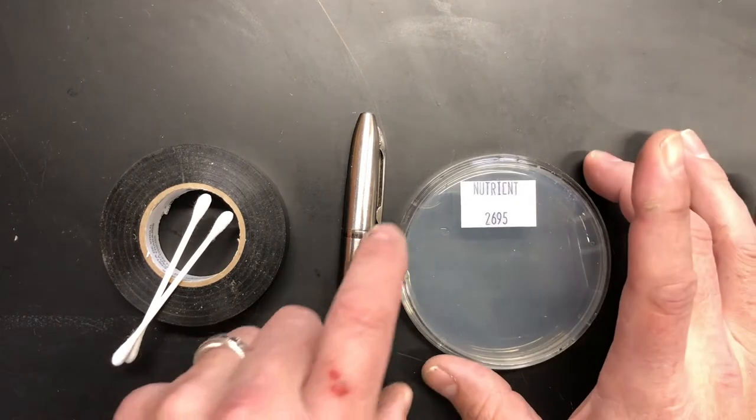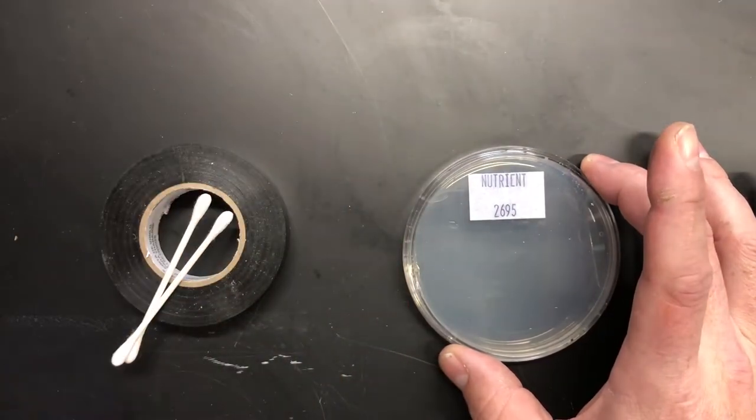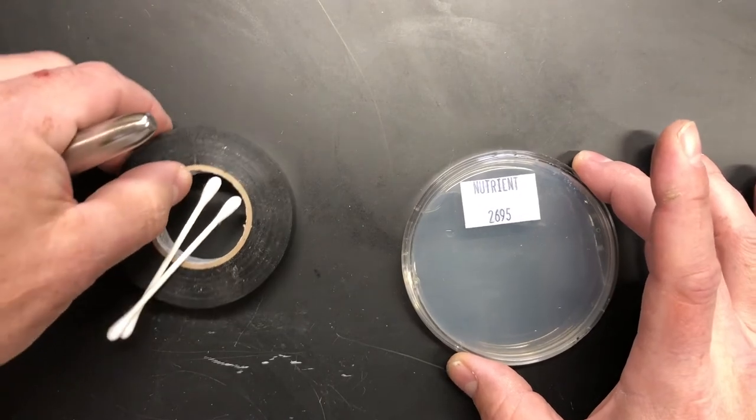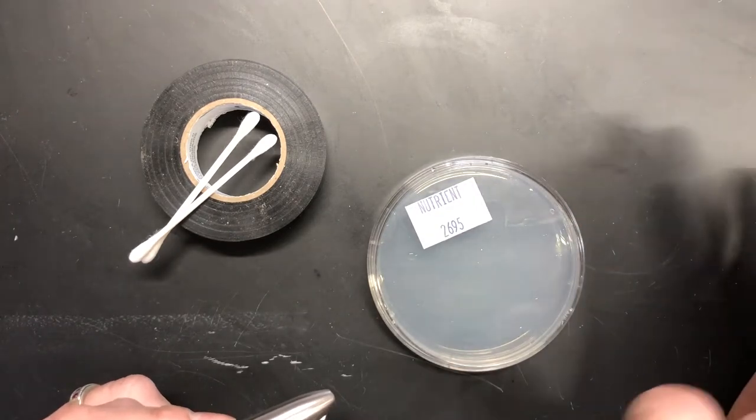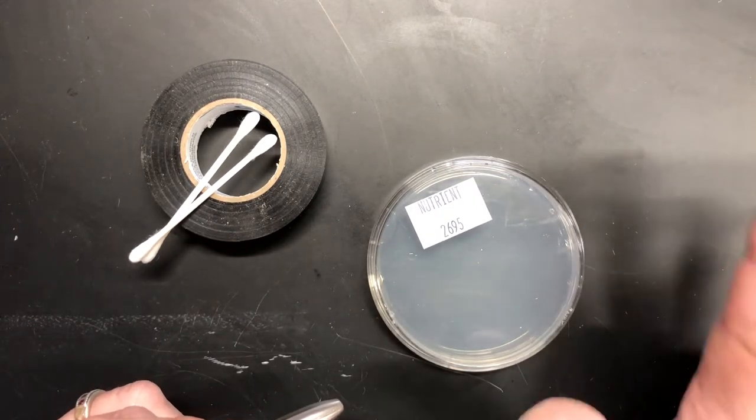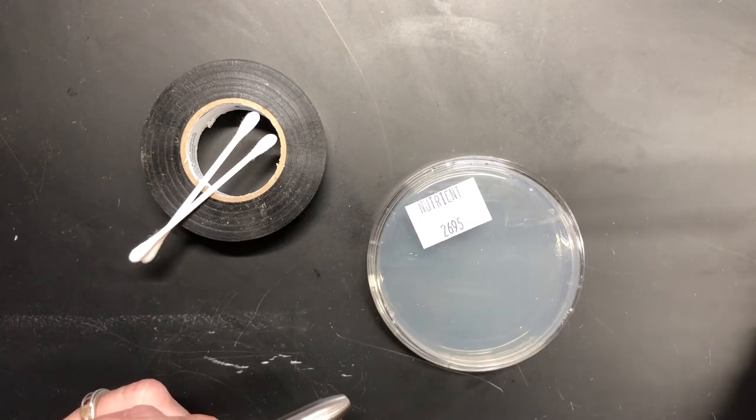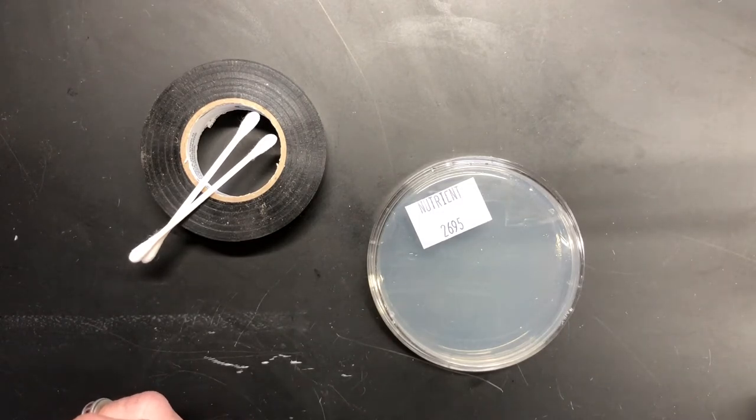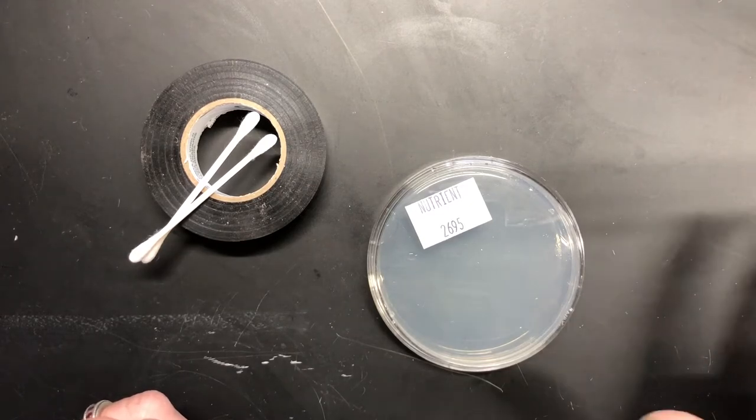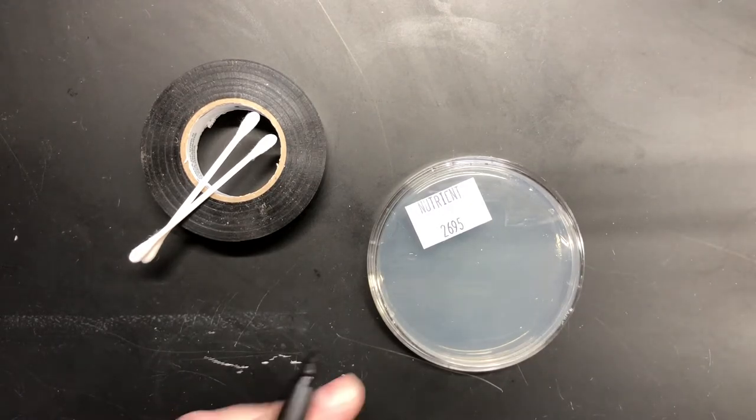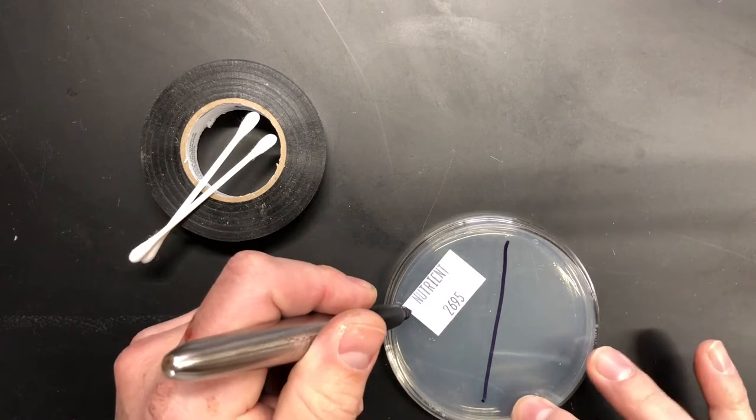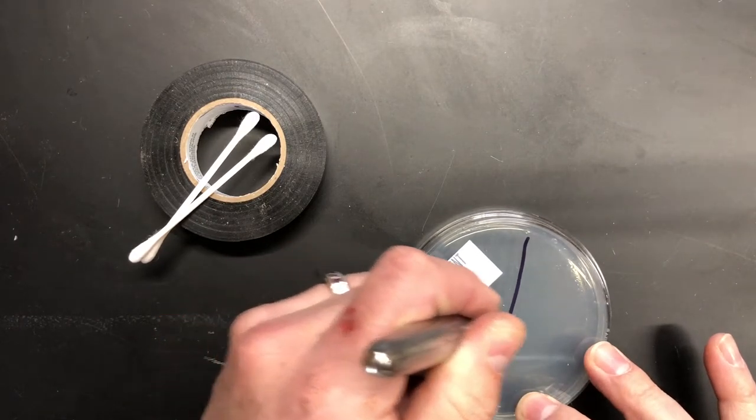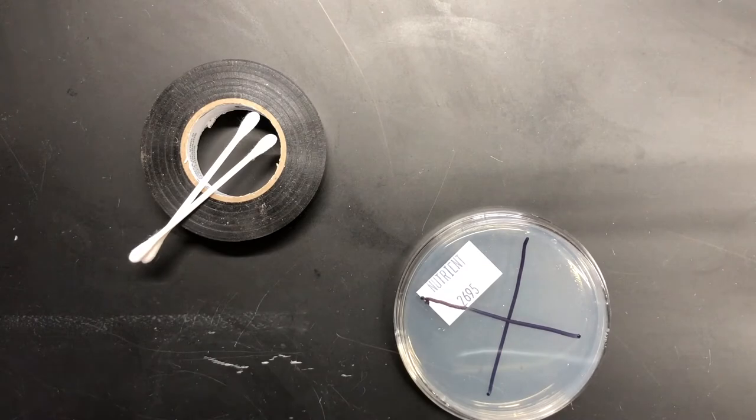Alright, so typically with your nutrient agar, I'm using nutrient agar because the list of things that grow on it is pretty extensive but nothing particularly alarming. There are kinds of agar that will let you grow things like anthrax and smallpox. Nutrient agar will not let you do that, so that's good to know. Having said that, we still need to be careful with this once we do have a colony. Typically you're gonna have groups of four students and you're gonna divide this out, maybe in half depending on your groups and how you decide to have them inoculate these.